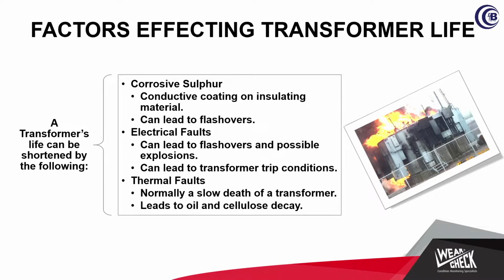But since then, quite a bit of research has been done on this topic. And under certain circumstances, your oil can change from normal to corrosive sulfur content. This is a yearly test. It won't change in 12 months' time. You don't need to monitor it every 3 months. But on a yearly basis, you need to look at the corrosive sulfur content of your transformer oil.